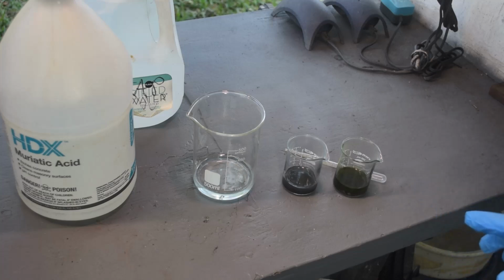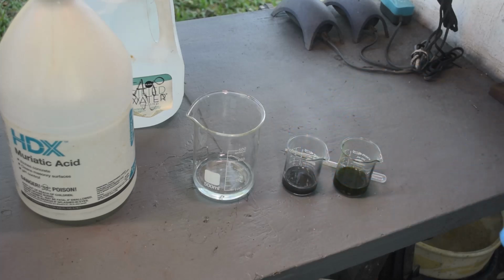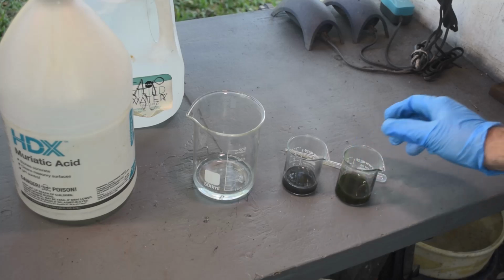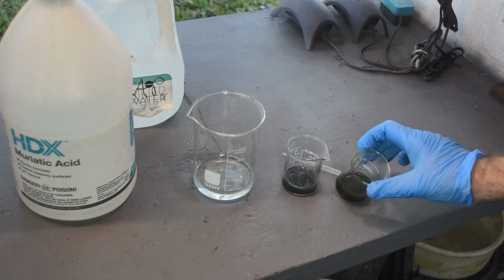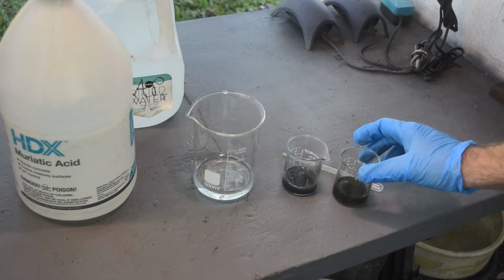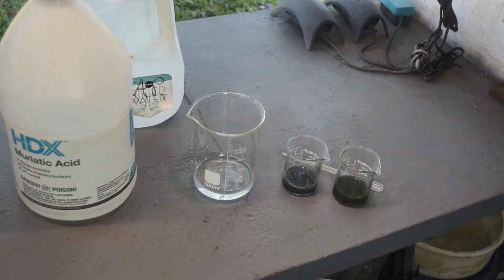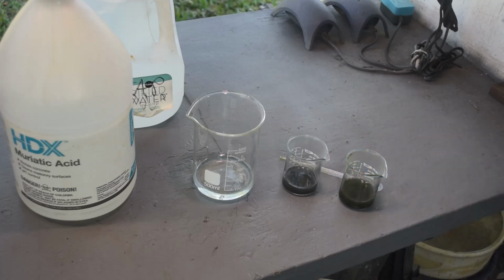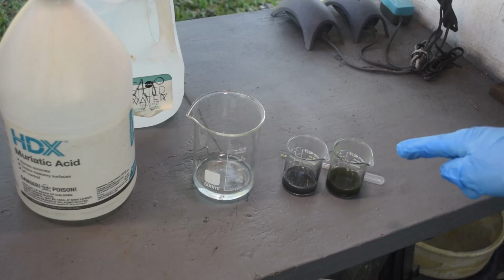Okay, so I would say that neither of these is carrying any significant or even detectable amount of our silver. So there's really no difference between them at this point, although if I let this go to completion, it might dissolve some silver. But I don't think I'm going to have that problem because I think I'm going to go with the hydrochloric acid, muriatic acid, whatever you want to call it, because I think it's going to do the job quicker. It's cheaper. I've got a lot of it, and I can give the stuff multiple treatments to make sure I get rid of all the iron and any other base metals present that will dissolve in it. So, yeah, okay. I think we're going with that.